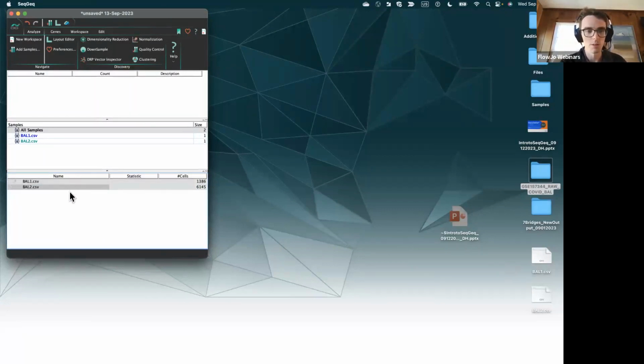Okay, so I loaded these two files. Now, before I even start my analysis, I just want to combine them together. They're the same condition, so they're going to be similar data. This can just help me pull my data together. If I want to later, I can always split these apart and look at them individually. But it's better to combine them together at first. That way, if I do machine learning or other tools on the data, it'll apply to all the data, so it'll all have the same machine learning and the same results. Then I can compare individual samples with those results and see what the differences are.